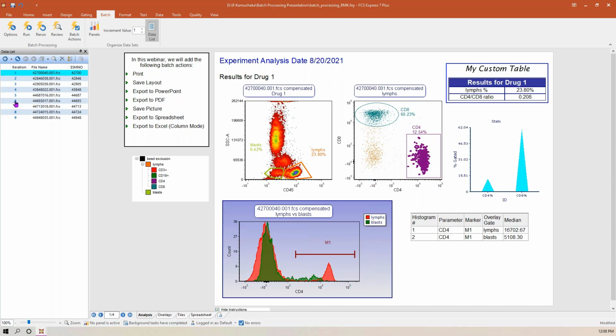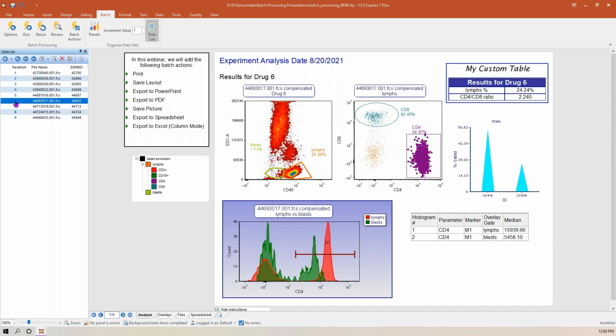So I'm going to actually deactivate one intentionally just so you can see what this would look like. So I'm going to drag out a data file here when I've moved to a different data file. And you'll see now that I've actually deactivated some of these iterations. Now, this happens quite a bit with using overlays or when you're inserting a summary spreadsheet.